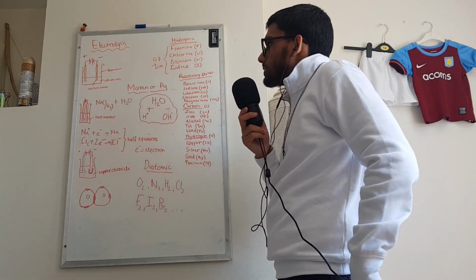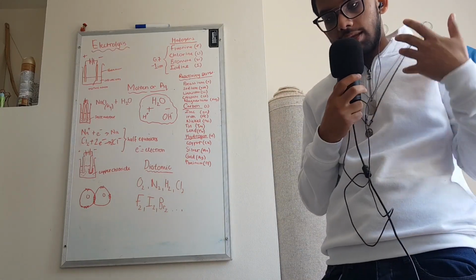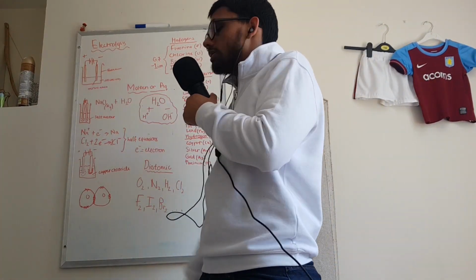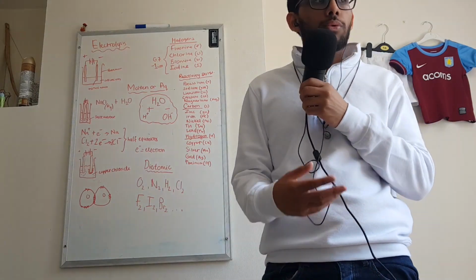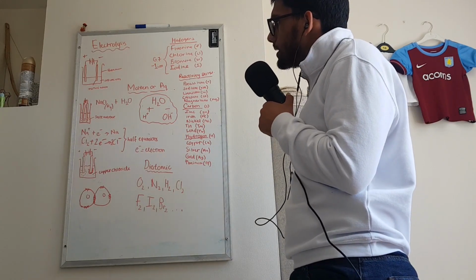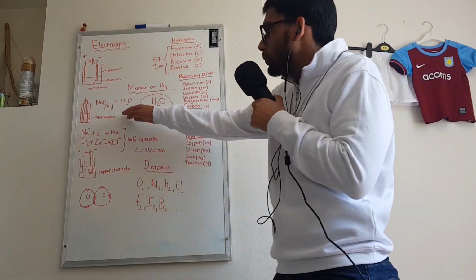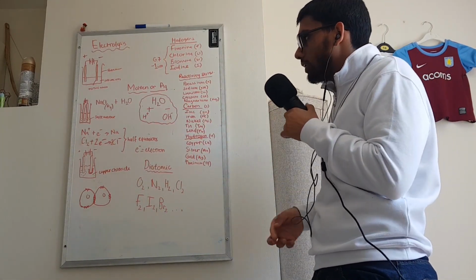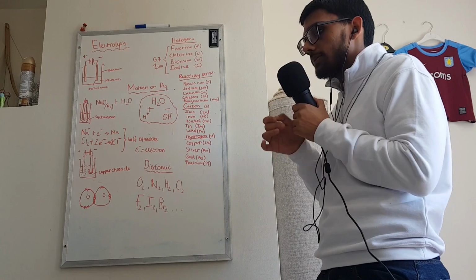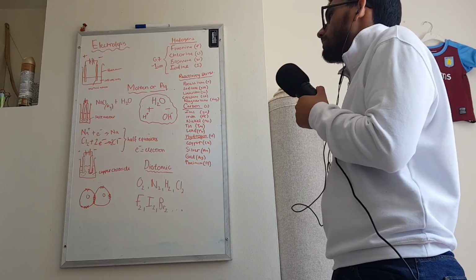Another way electrolysis is used, it's used to form bleach. Another rule of electrolysis is you never have the two terminals touch, because electricity won't flow through the solution, rather it will just pass between the terminals. So what you really want to do is have the two terminals as close together but not touching, and you put in a NaCl aqueous solution, and you'll run electricity through it, and as the terminals are close together, the chlorine will react with the sodium hydroxide to form bleach. Bleach is really easy to make.